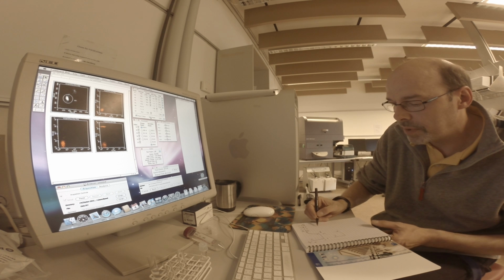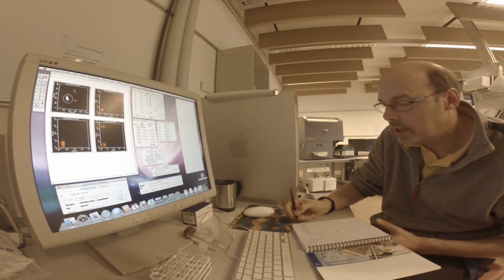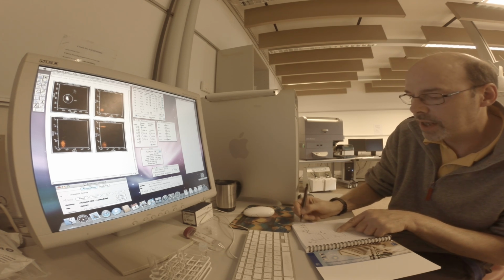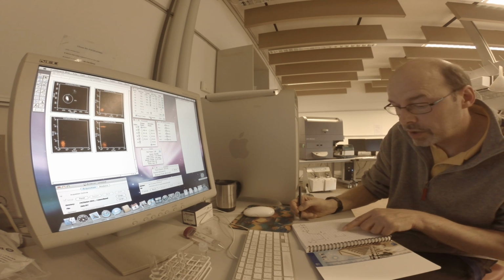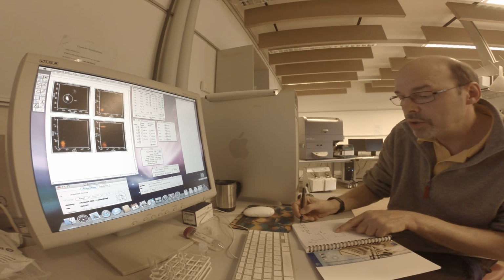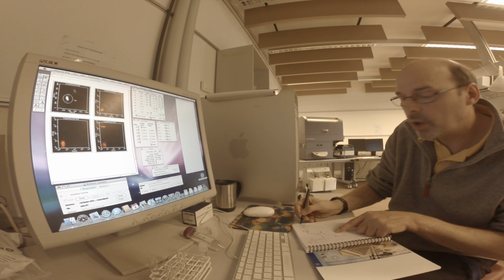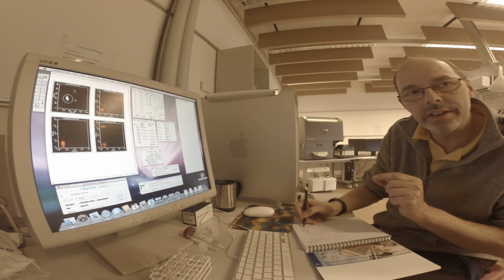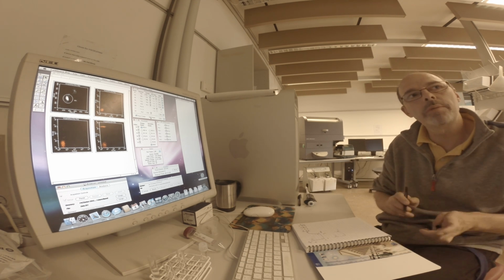So as long as the compensations are 0, you will still display the right number. It will just be, say, 725, and this one is then 50 or so, because it's moved up a little bit. That's right. And once you play with the compensation matrix, that one will be adjusted to 10, that one will be barely affected, and then you get the true values that are shown. That's probably the way to do it.